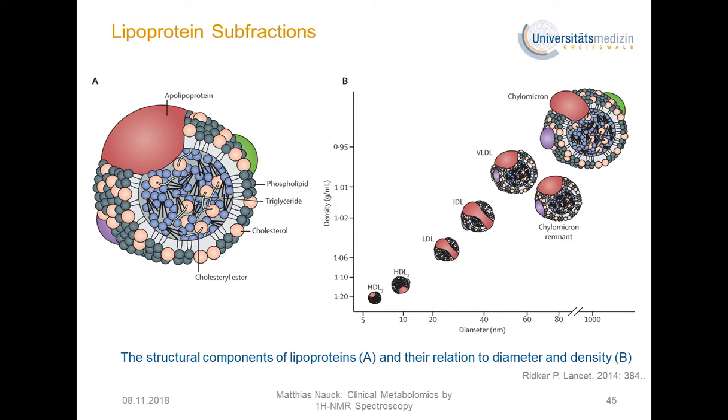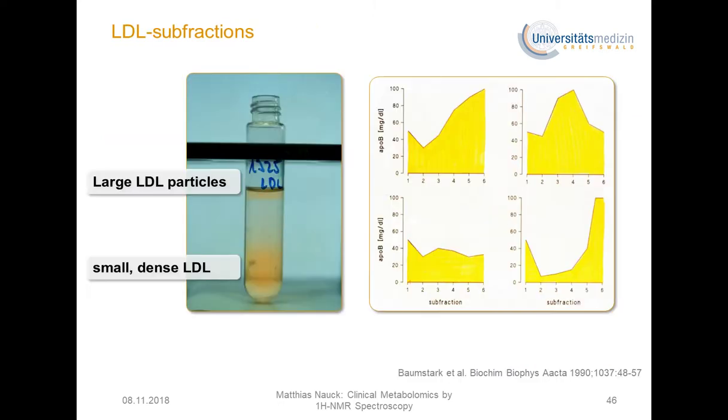And we learned over decades that, for instance, LDL cholesterol is the bad cholesterol, the risk of cardiovascular disease development is much higher, and the HDL are protective. On the other hand, when we look more into detail into the class of the LDL, for instance, here's a classical approach with a huge ultracentrifugation process, and then we are able to divide these lipoproteins into further subfractions.